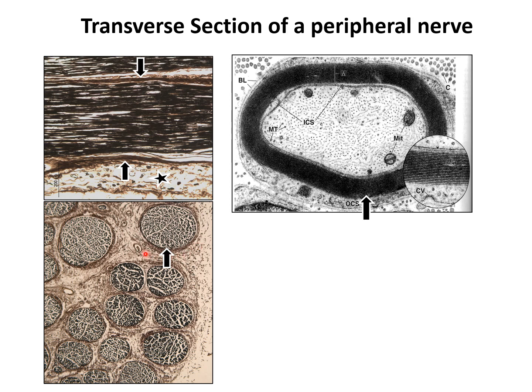The connective tissue also takes some amount of stain. So this is the perineurium, and outside is the epineurium. The endoneurium will be visible in higher magnification. Here, this is the perineurium, and the whole structure shows the myelin.